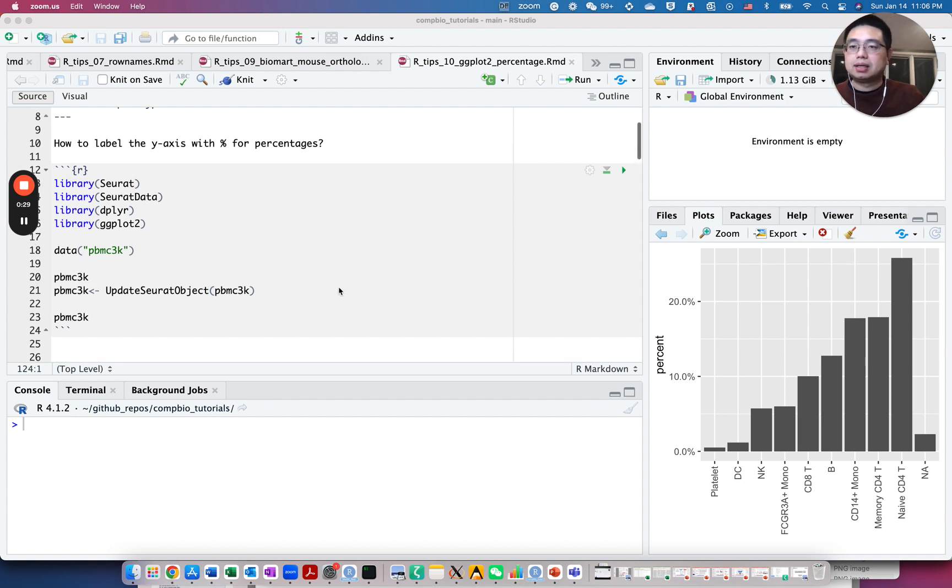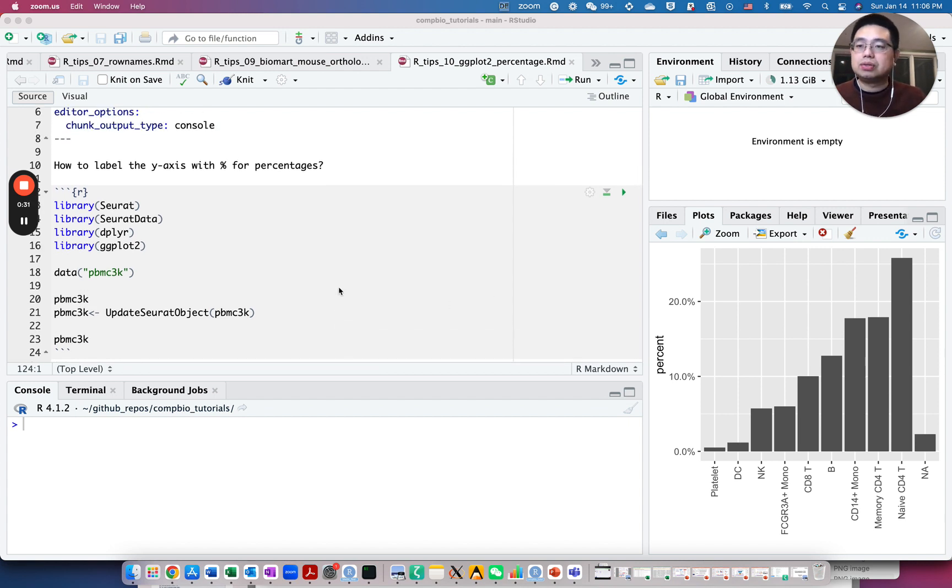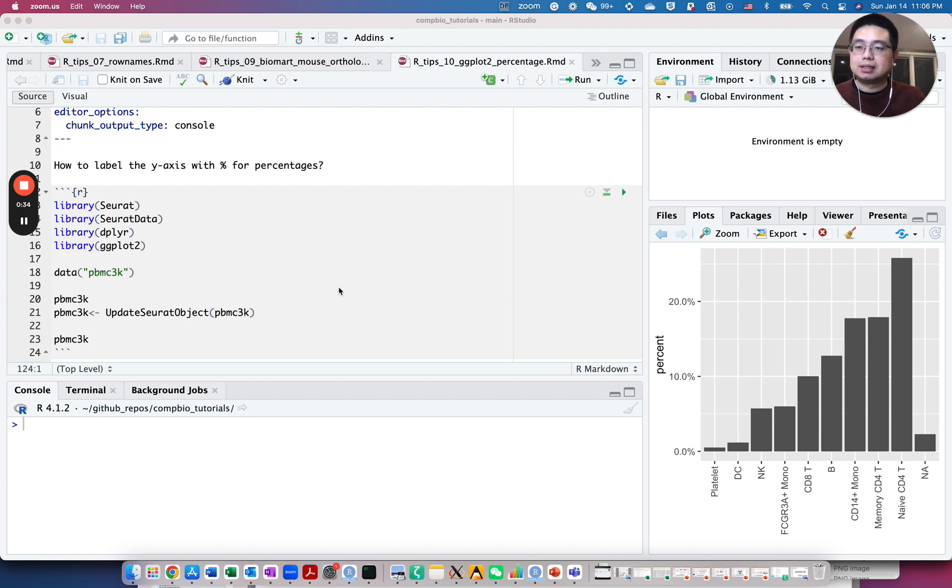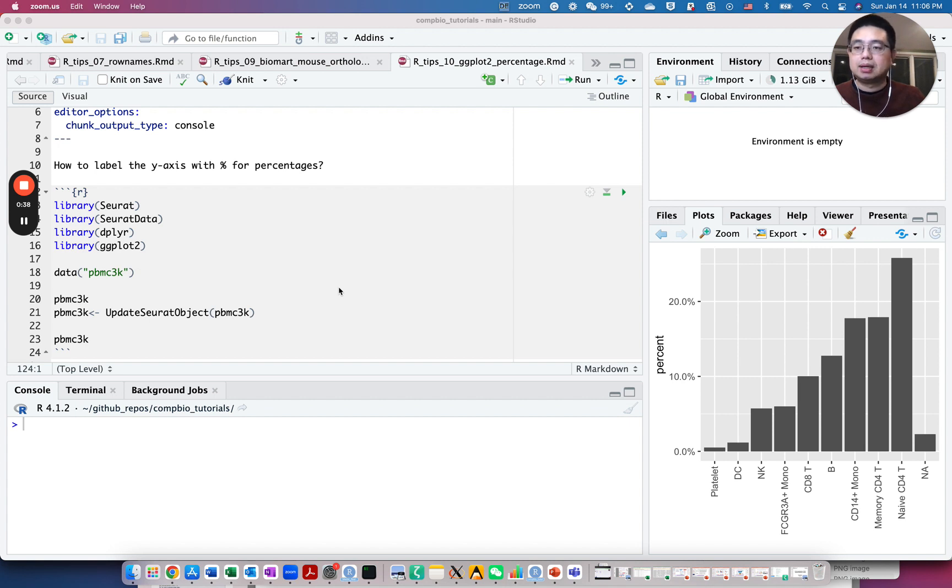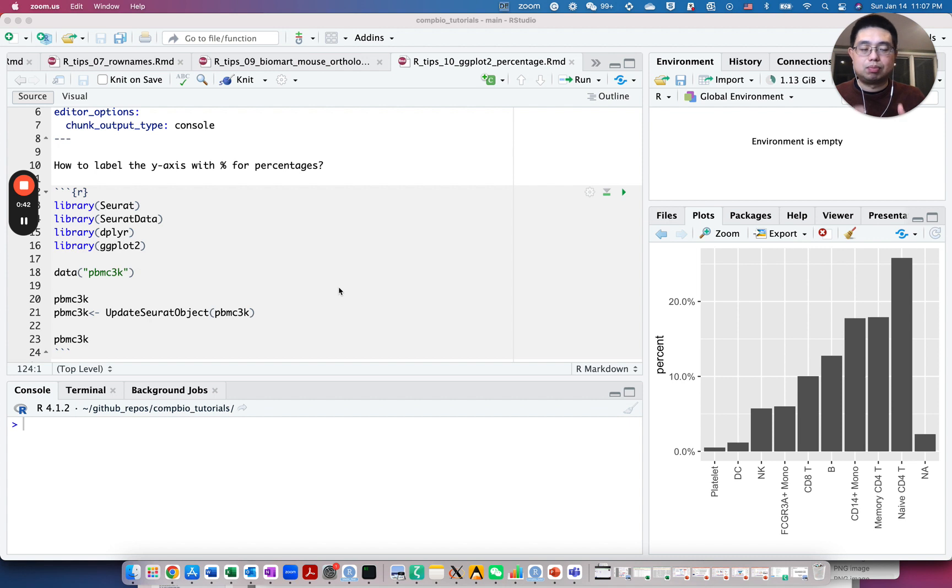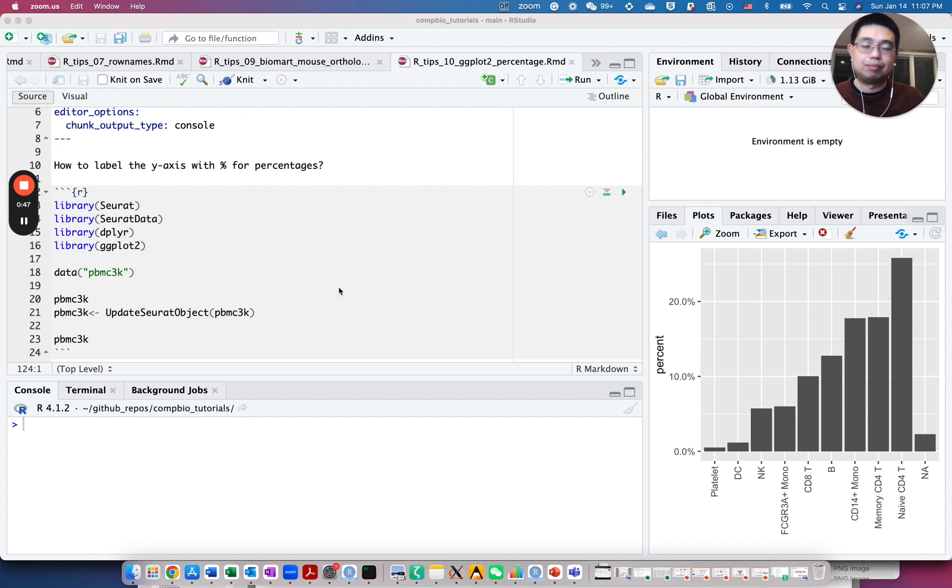Here to illustrate, we will use this single cell RNA sequencing dummy dataset, the PBMC 3k dataset, as an example. Because in this dataset, it has multiple cell types, and we want to plot the percentage of each cell type for this sample.